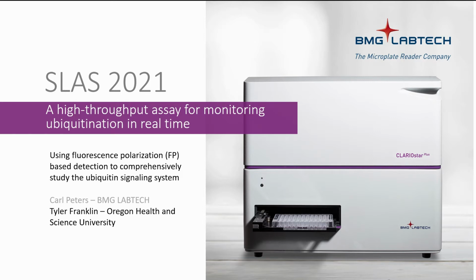Today, Tyler will tell us about ubiquitination and the multiple steps involved in this process. He will also touch on the importance of this modification and how distinct types of ubiquitin linkages have specific impacts on proteins. Further, he will show how better understanding of ubiquitination is needed to improve how we can address diseases associated with alterations in ubiquitin signaling. He will also describe how they use their CLARIOstar to develop an assay that is helping them better understand ubiquitin signaling and all its complexities.